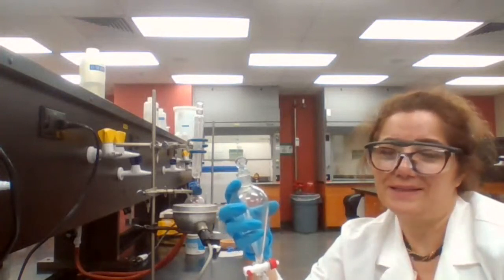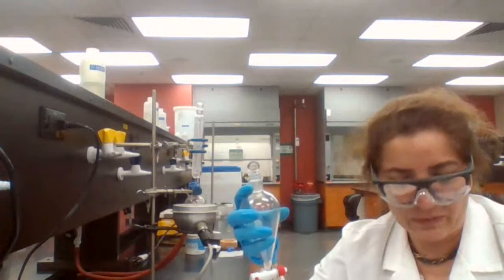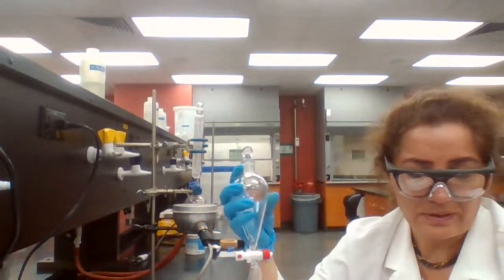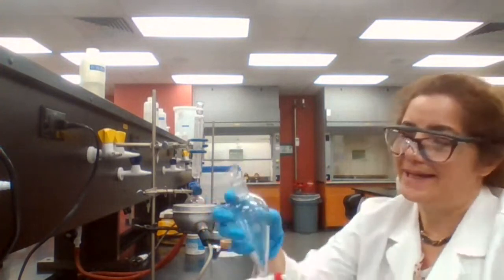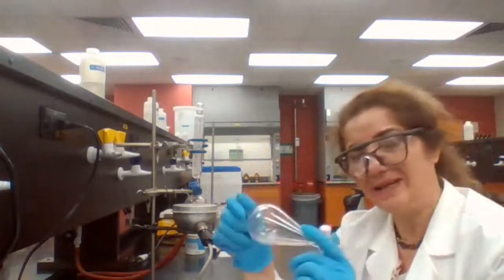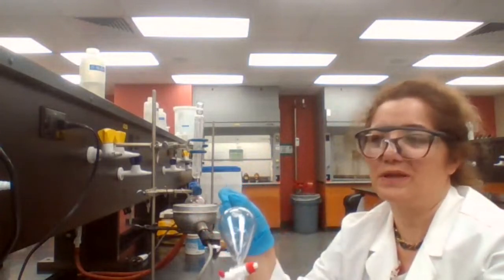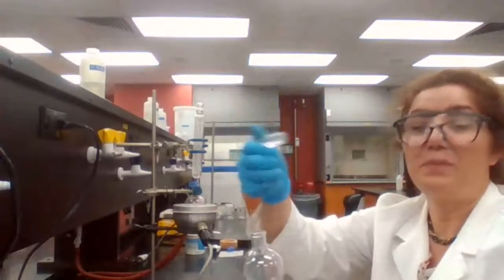So basically, you get carbonic acid, H2CO3, and the H2CO3 will decompose because it's very unstable, and when it decomposes, it changes to water and CO2. That's why when you are using that solvent to wash your organic layer, you need to make sure to shake it and vent it. In the fume hood, you have to vent the separatory funnel to release the pressure that is built up. Otherwise, if you leave it on the stand, it is going to pop the cap.